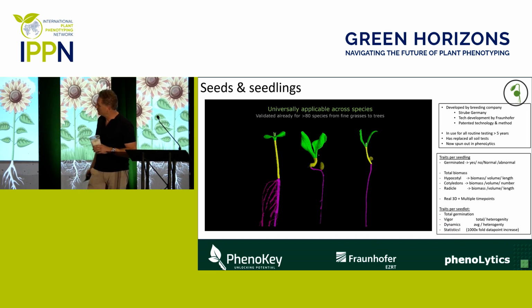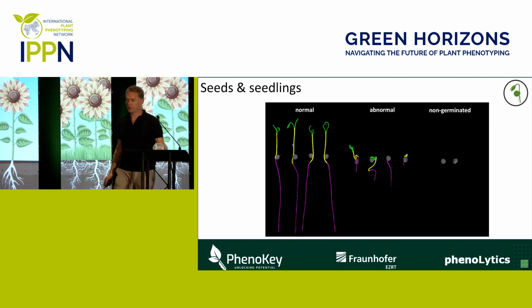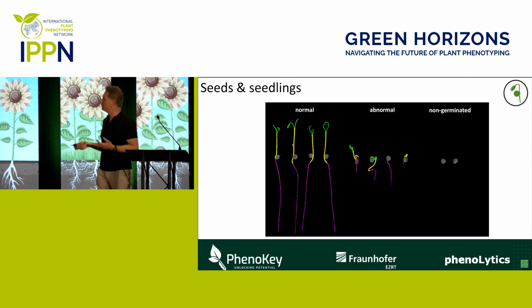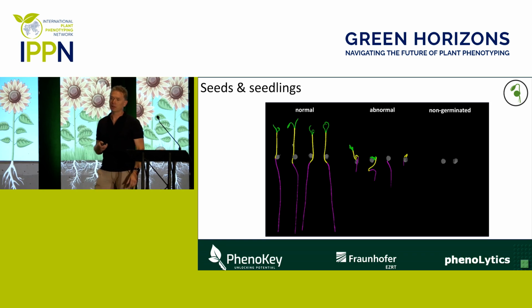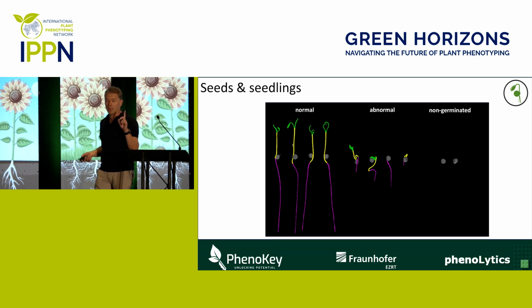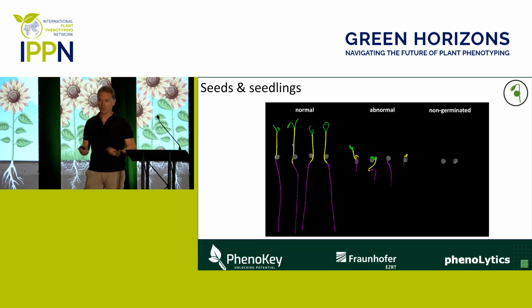On the bottom right, you see all the traits that can be extracted. So what can you do with that information? For instance here, this is just the basic information. On the left you see normally developed seedlings. In the middle you see abnormal seedlings. And on the right you see non-germinated seeds, obviously. The abnormal detection can also be done automatically by the software, and that can be configured based on the crops and also preferences of interest that the user has. And by the way, this technology is already in use for 5 years within this breeding company for routine screening. So it's not in a lab, it's actually used day to day.